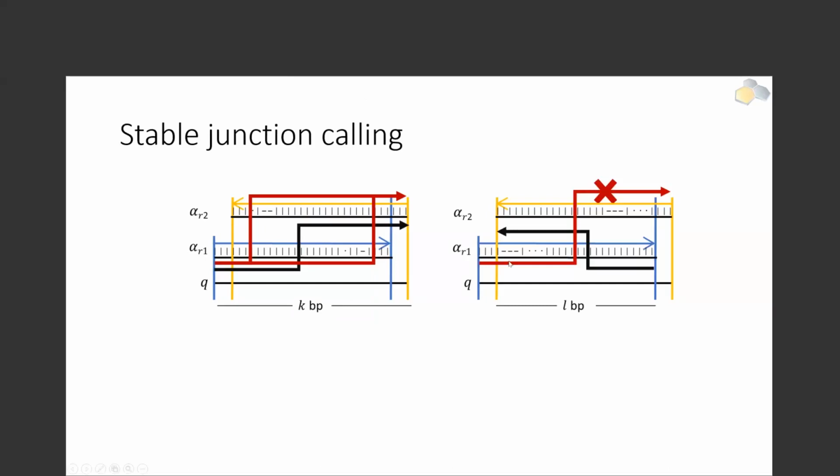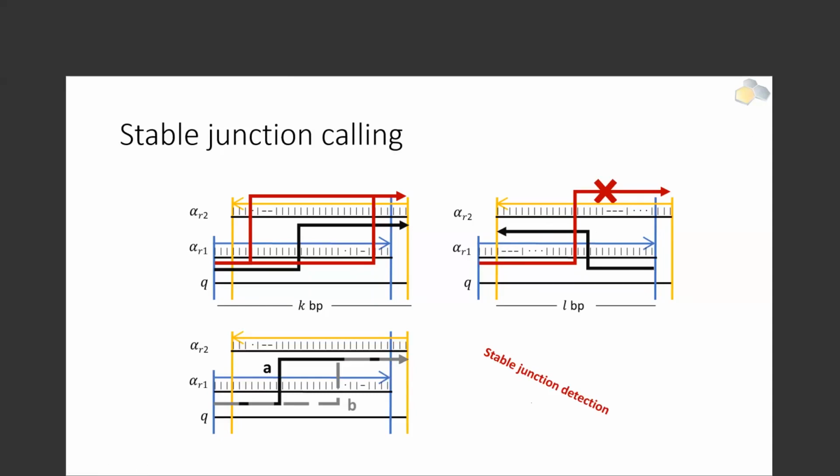And you can see that this is possible not only in one direction, right? You might have two reads actually being a better combined alignment if you conceive them as a reverse direction, and in that case that would create a much better score. So these are all features that make this junction detection approach unique compared to other techniques out there. And the reason you need these techniques is simply because we're dealing with viruses, and these viruses have a lot of mutations.